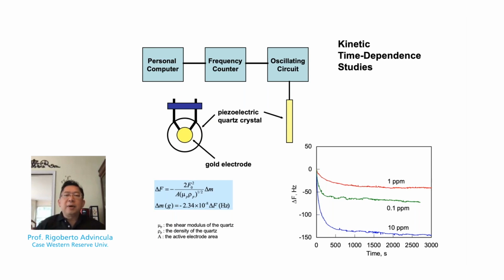I will not be able to describe a lot of those types of experiments, but suffice it to say, other than looking at the frequency shift and viscoelastic nature, as I described, QCM is one of the best methods to investigate time dependence phenomena or kinetics on surfaces or adsorption.